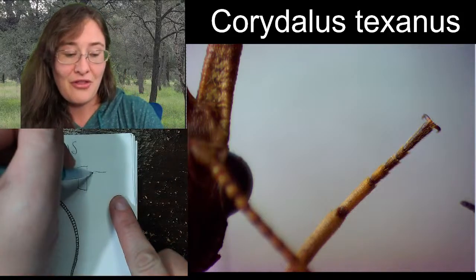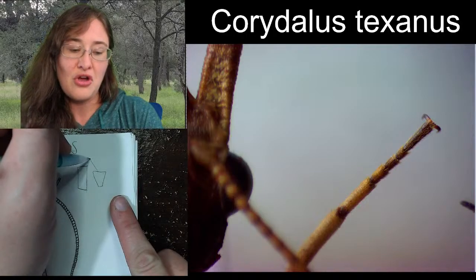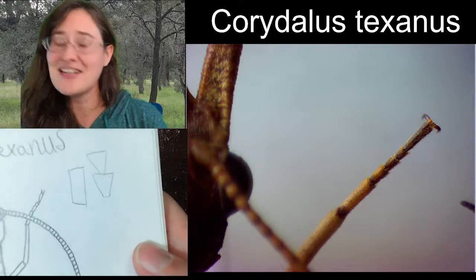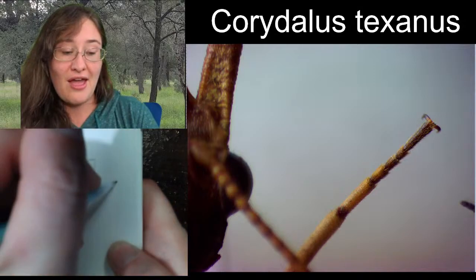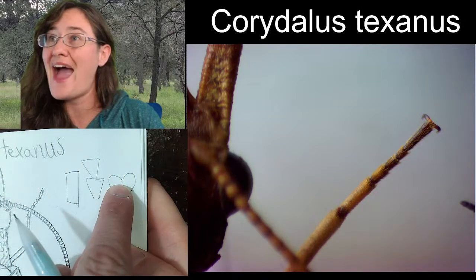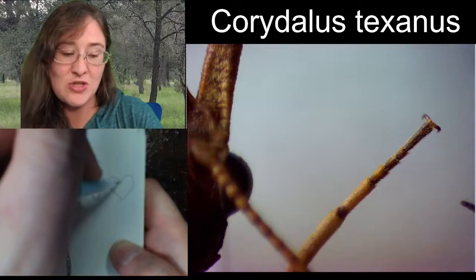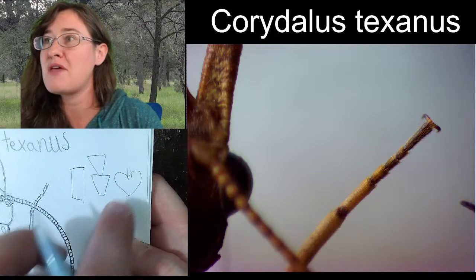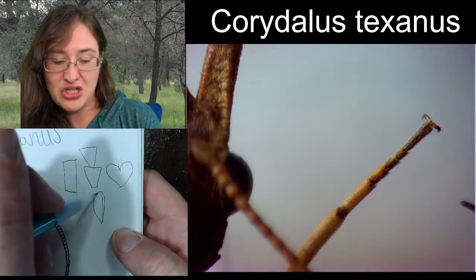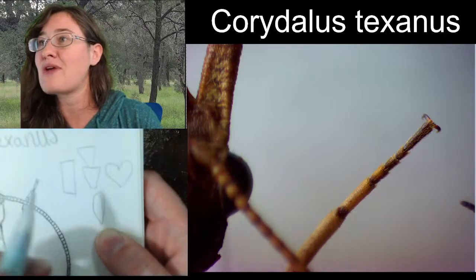You have the ice cream cone, where they look like ice cream cones that could be stacked. You have the heart shape, where there are 2 pads and the segment comes out from in between. And then you have a water droplet shape that's narrow at the top and rounded at the end.